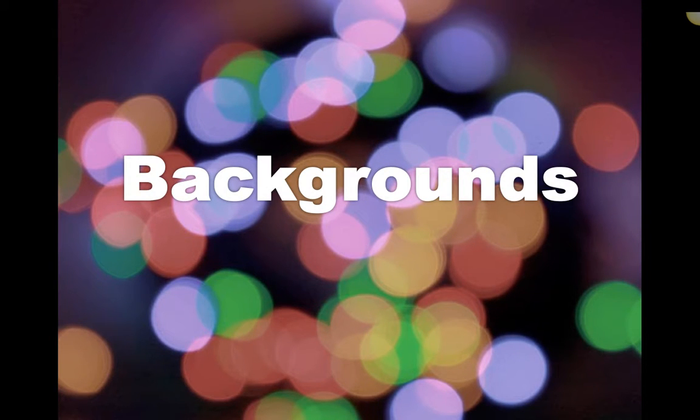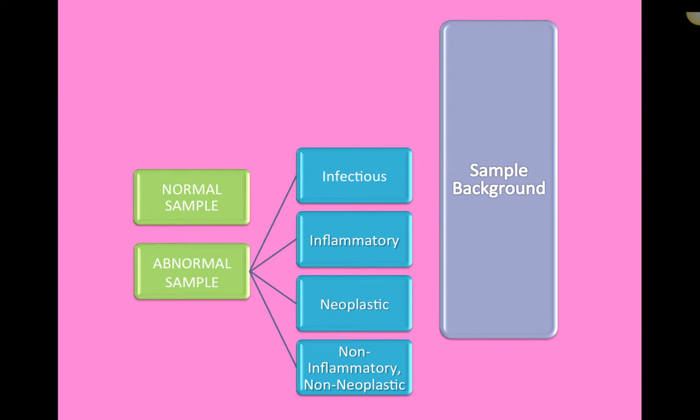Very brief PowerPoint presentation on backgrounds. It's just to confirm some information about when you are looking at your slide, how you report your findings. We've got that big chart that we go through in regard to infection, inflammatory, neoplastic, non-neoplastic, non-inflammatory, etc.